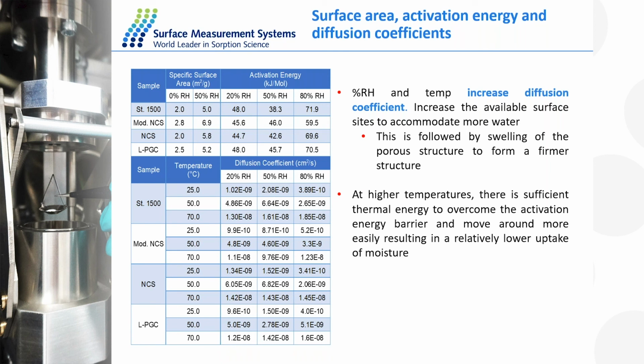Yeah, we can discuss that further offline if you are interested. We have more results, but at the end of the day, it's just the way the material behaves. We have some video images of the material, and work is still ongoing to investigate the effects. But actually, it shows the material is almost caking, and that is part of the reason.